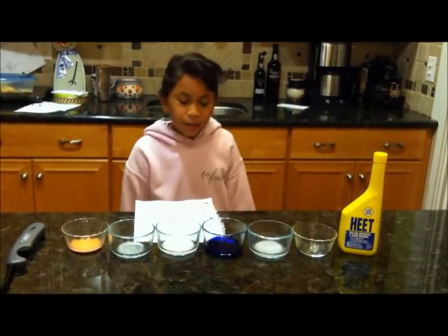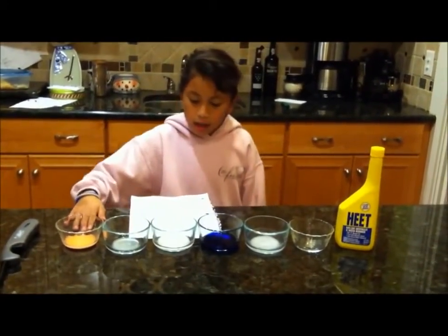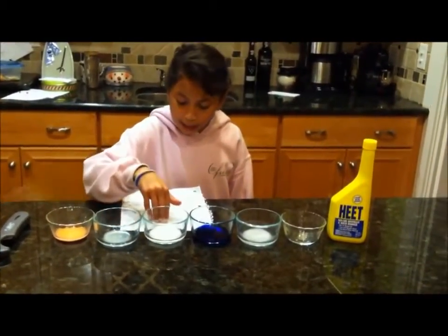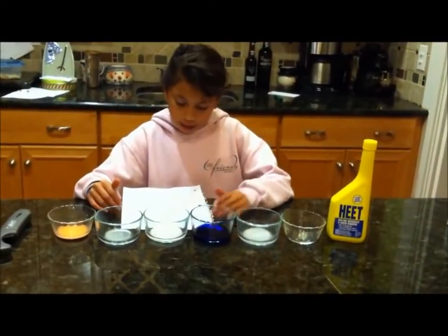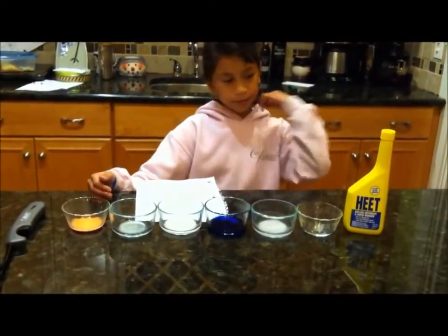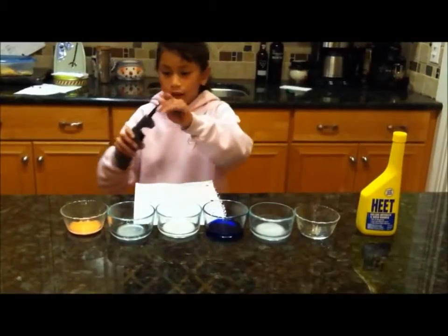We are going to do a rainbow. Here is calcium, sodium, boric acid, copper and potassium, and then just regular heat. I already poured all the chemicals into each bowl, now I am going to light it.